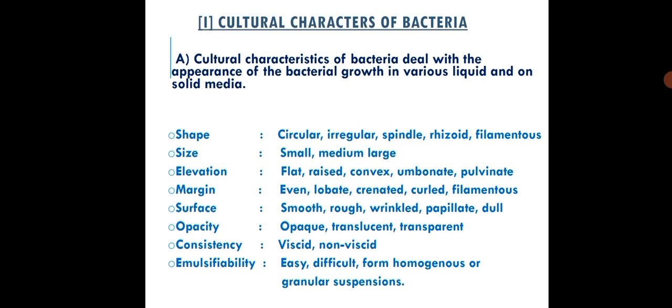Size that can be small, medium, or large. Elevation that can be flat, raised, convex, umbonate, or pulvinate. Margins that can be even, lobate, crenate, curled, or filamentous. Surface that could be smooth, rough, wrinkled, papillate, or dull. Opacity that can be opaque, translucent, or transparent.